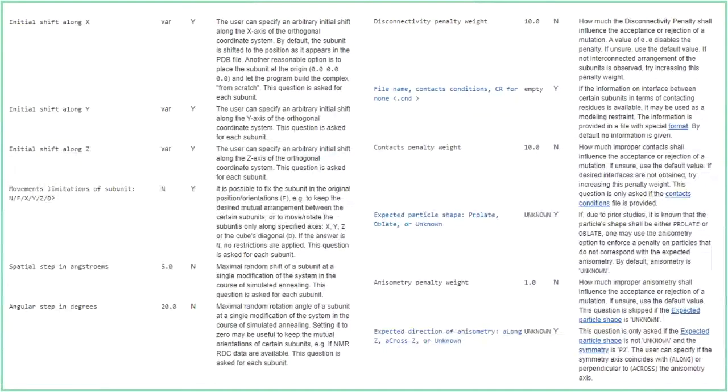In the absence of previous knowledge, it can actually lead you the wrong way, because all it's trying to do is reach some sort of shape that fits your SAXS data, and that may not have any biochemical relevance. It is up to the user to provide an appropriate amount of information to keep it on the right track.